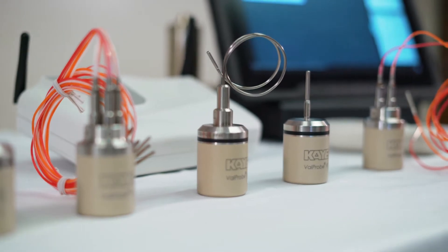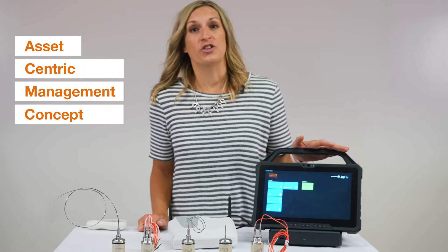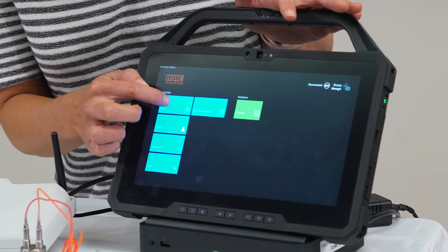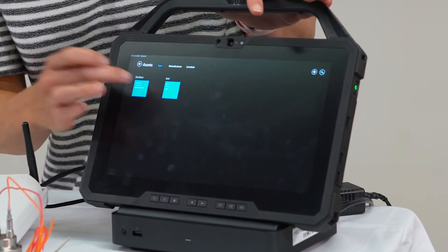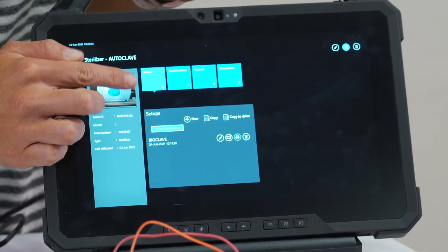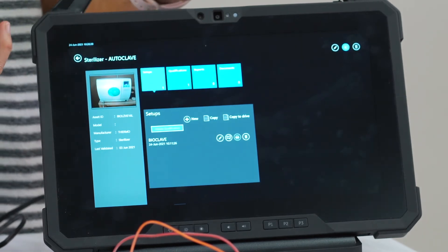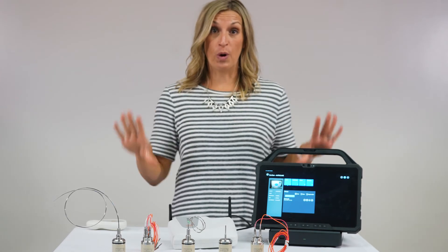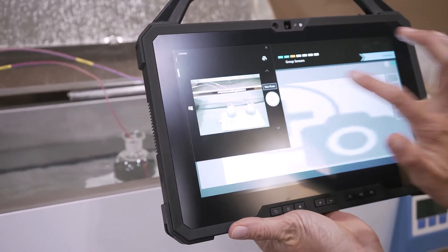Our validation console — the tablet — has the asset-centric management concept like our Validator AVS. When you select an asset, you'll see setups, quals, all your reports, and any documents you may want to add to the software. This could be the user manual, the SOP, or a valve probe layout.